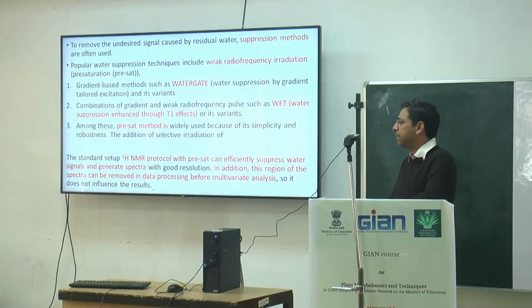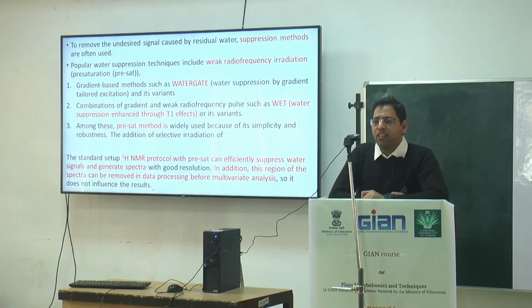And the third is presat. Presat is the most adopted method actually. We have already used it many times and we are using it due to its simplicity. You set it beforehand and remove the water peak from there. Then you can use it. So basically, when we use presat, you don't need to bother about the water peaks.